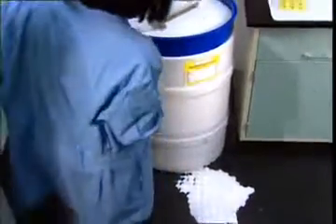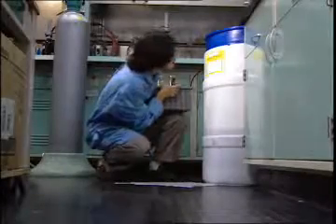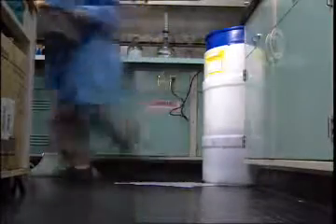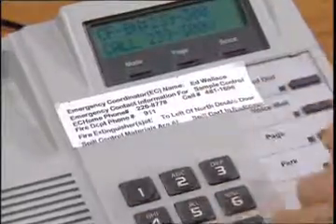In the course of lab activities, anyone could become involved in an emergency. You could discover a leaking hazardous waste drum that might be an environmental or safety threat. Every lab worker should know the proper steps to take in an emergency. The first step is to notify the responsible authority. You need to know who to contact.